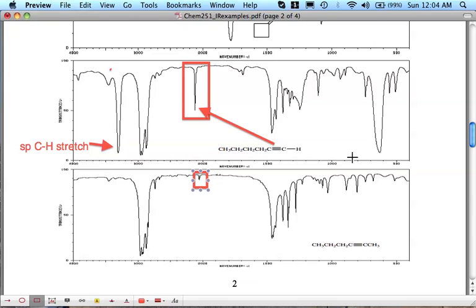Of course, that's a relatively unusual case, to have a completely symmetrical molecule like that. And I'm not going to try to fool you with that on an exam, give you an example of one that doesn't have anything to see and expect you to know that. But you might run into it in real life. You're going to be doing unknowns. You could have something where it's a weak absorption, and so you need to understand that that could happen.